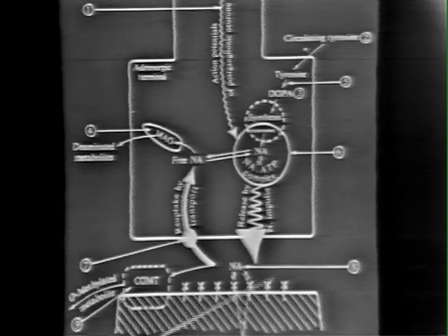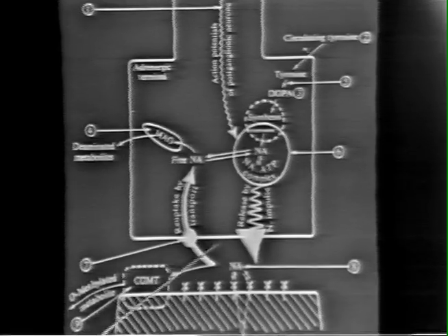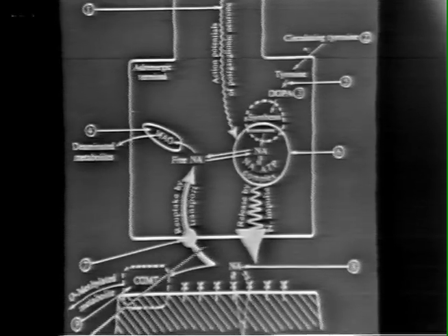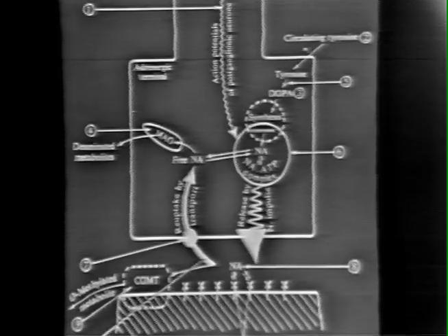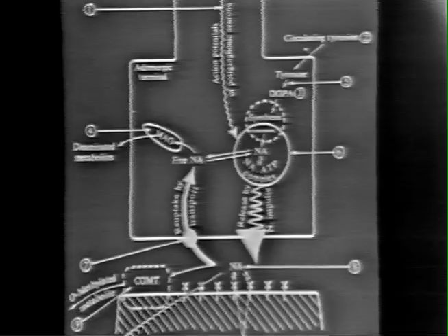We noticed several things about responses to low frequency and to high frequency stimulation, always using the same number of impulses. The response to high frequency nerve stimulation was greater than that to the low frequencies. Why is this? Even though we gave the same number of impulses.